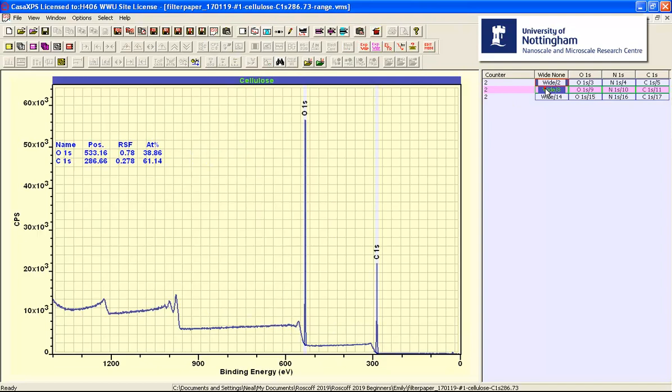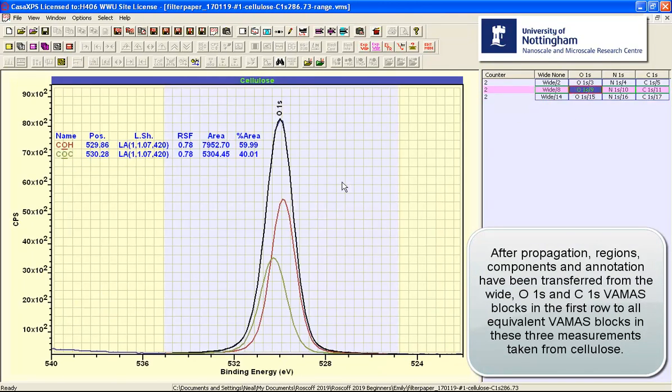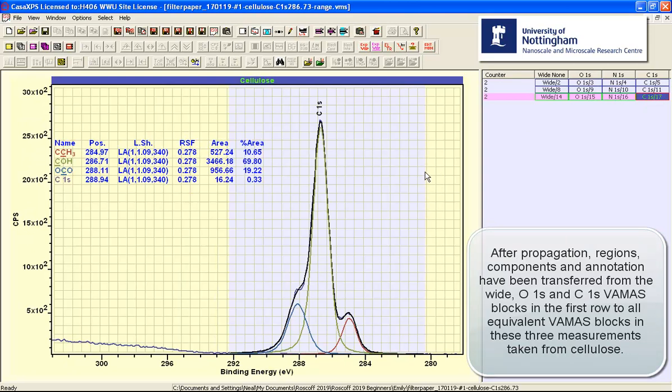This means that for each one of these spectra we now have the quantification information plotted over the data, peak fits that have been fitted to these data, and they're ready for quantification.